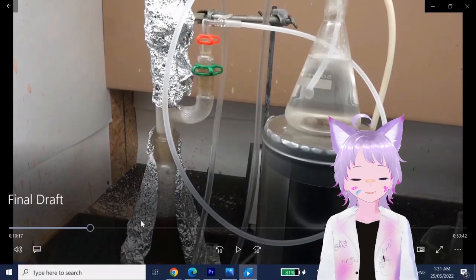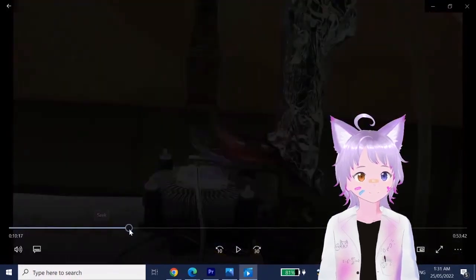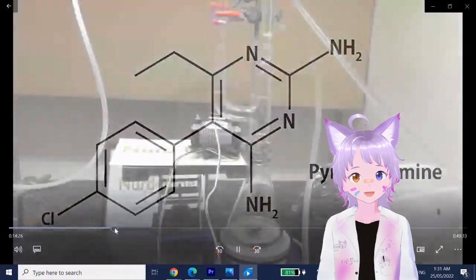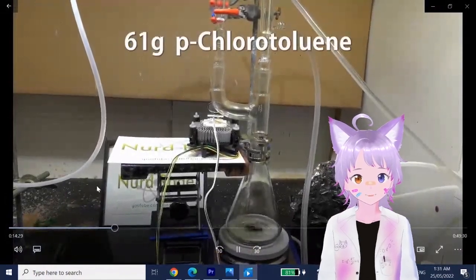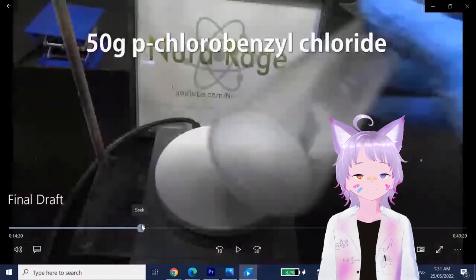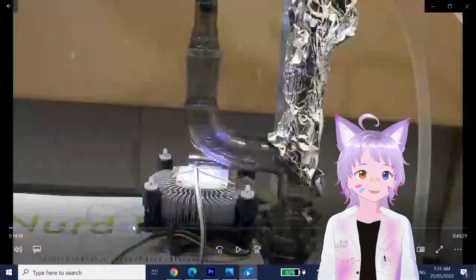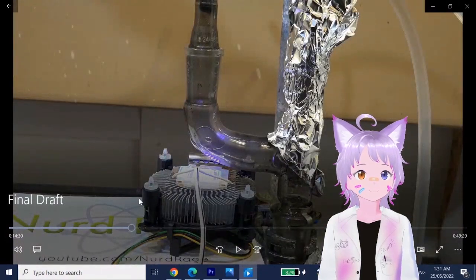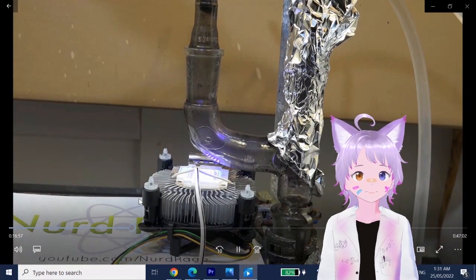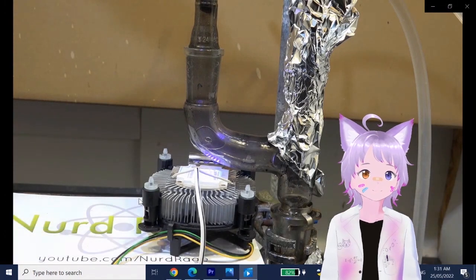Their radical chlorination. I wouldn't recommend doing it exactly that way. I think a more diffused light source would be better in a longer tube. Like, I would put it up at the condenser, maybe. Or at least get a tube or something, because this looks cringe. Think about it. It's like, holy shit.